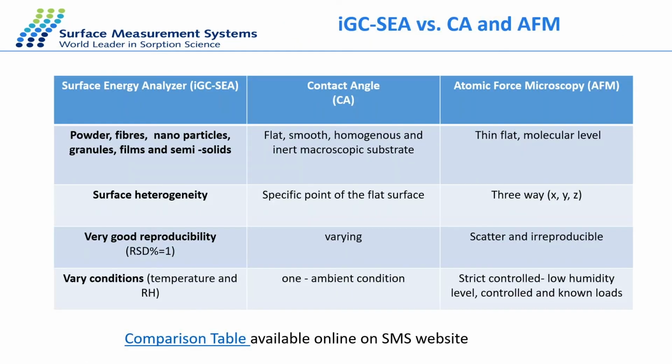The surface energy can be measured with other techniques as well, like contact angle or atomic force microscope. In this table, you can see a short summary and comparison between these techniques. If you are interested in a more detailed comparison, you can visit our website. Just to highlight a few differences between these techniques.